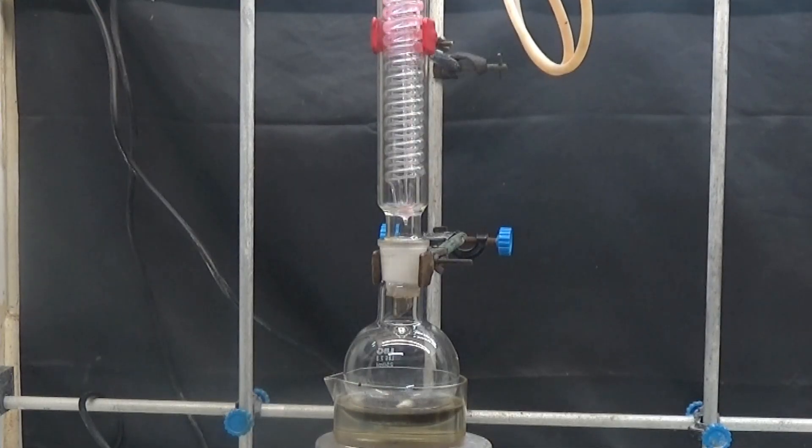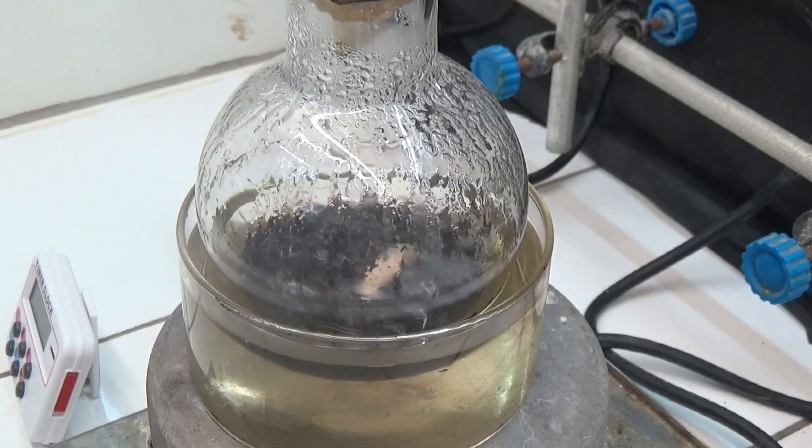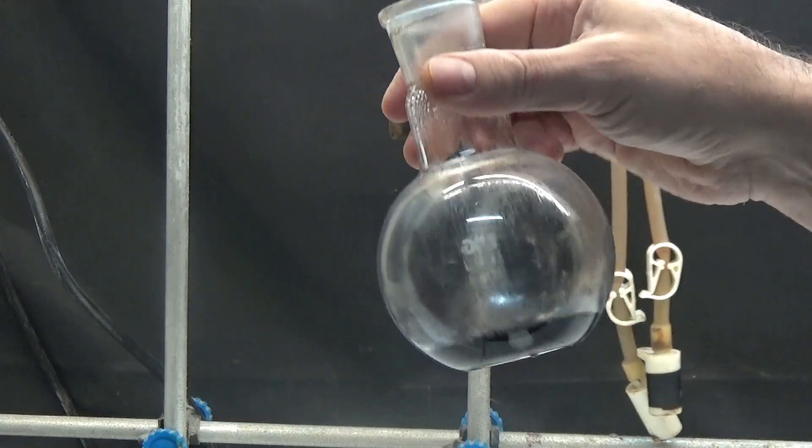Stir to homogenize the mixture and heat the flask with an oil bath and a condenser. Heat the mixture for 2 hours at reflux. The reaction product is a black solid.